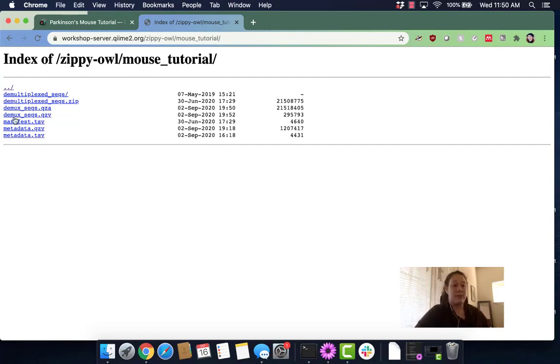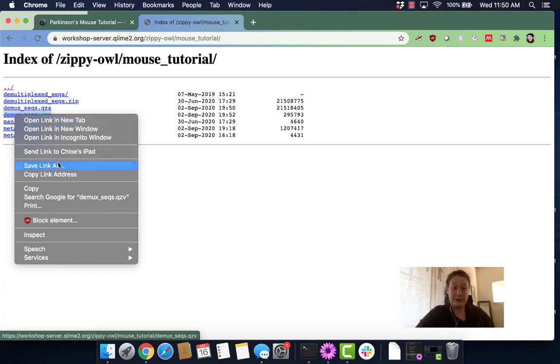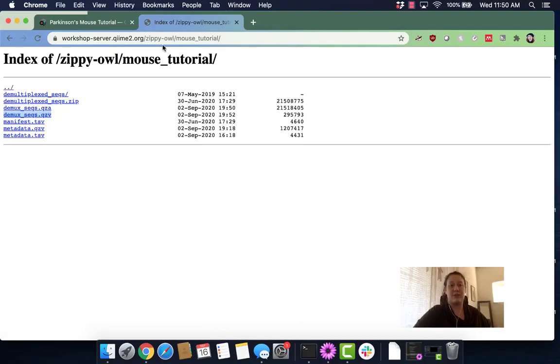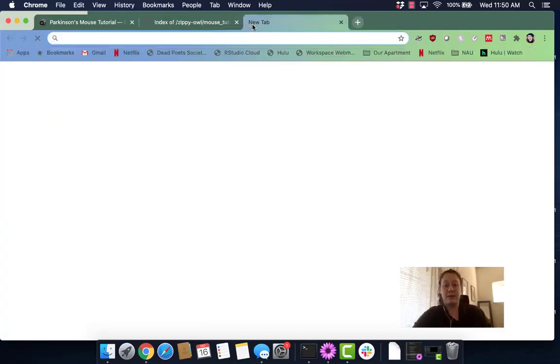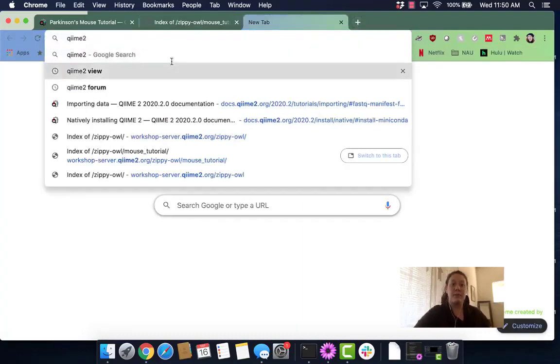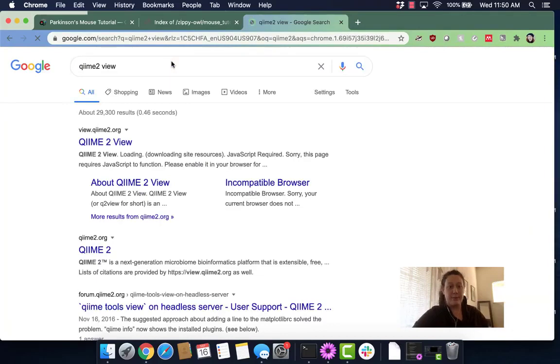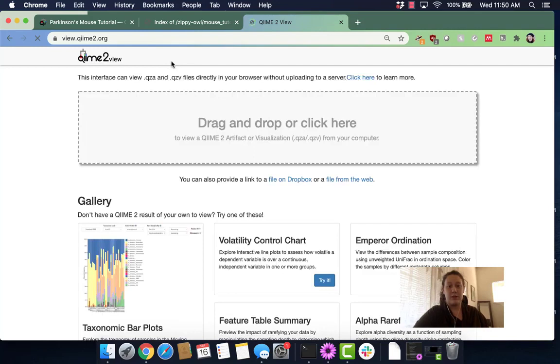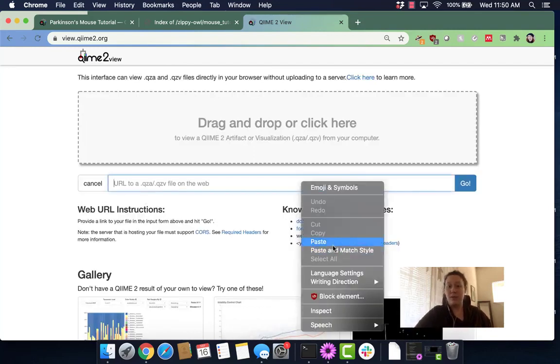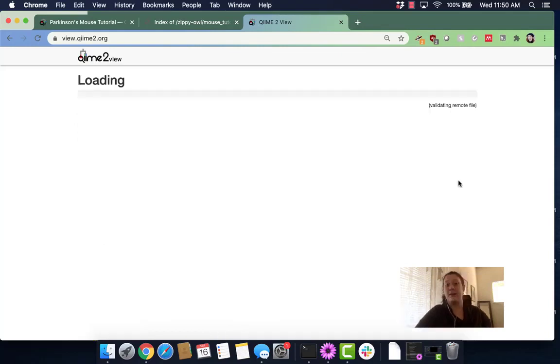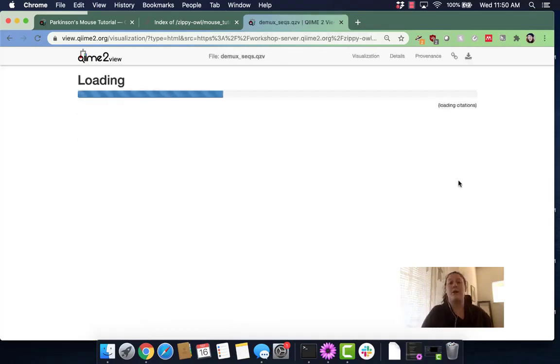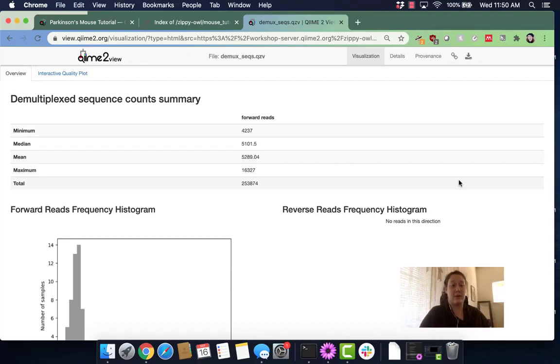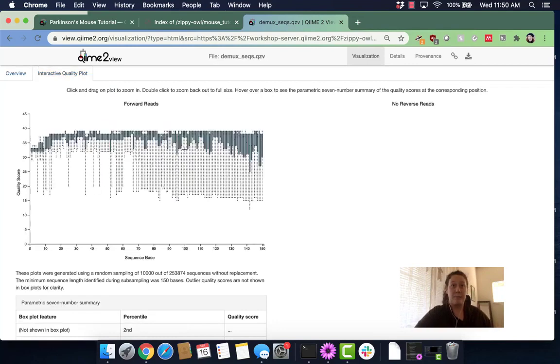I'm going to go to my qzv file. We have one called the same thing that's a qza file, so make sure you go to your qzv file and copy that link address. Then I'm going to go to QIIME 2 view, and we're going to provide a link from the web and paste that in there.